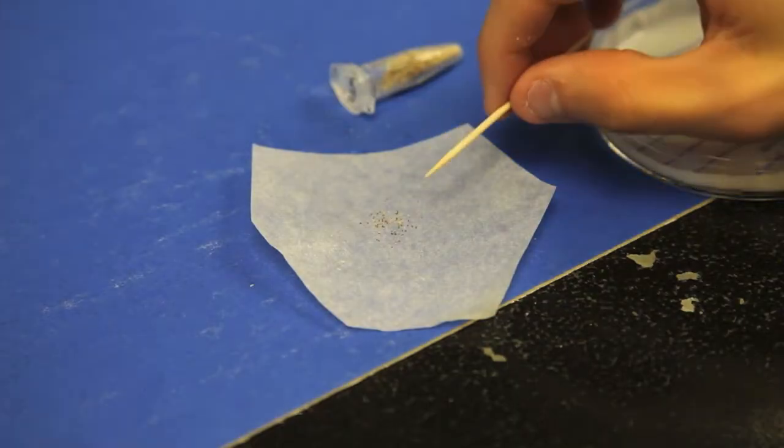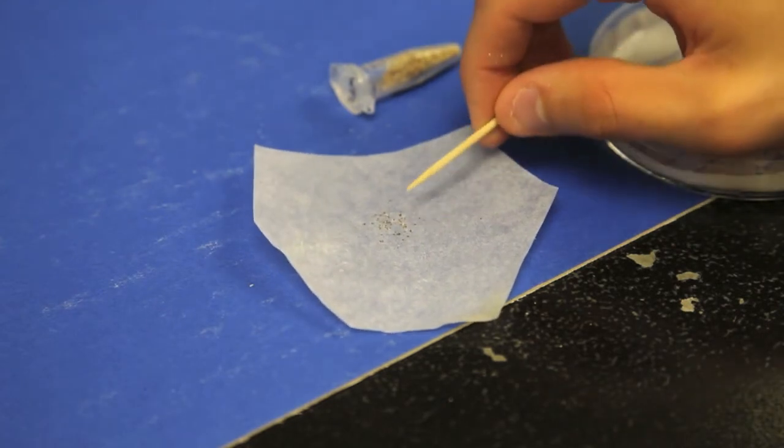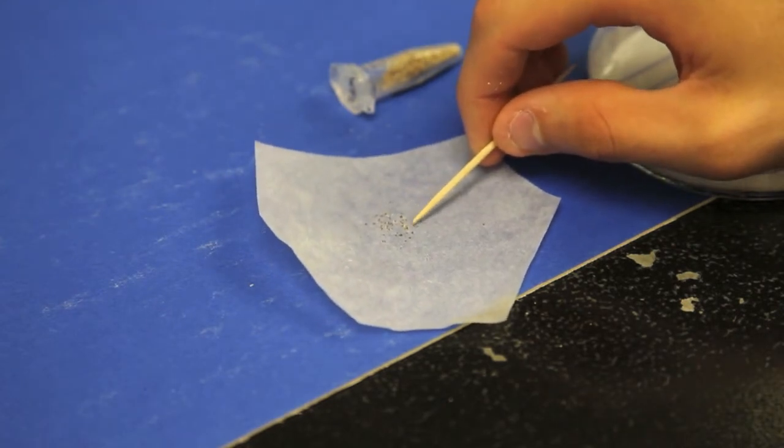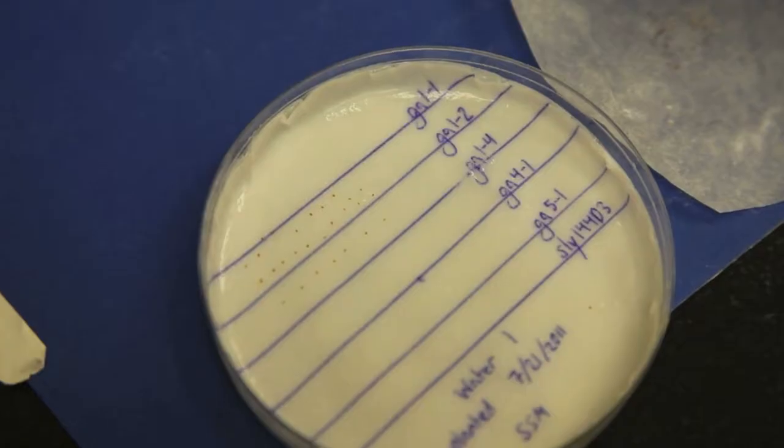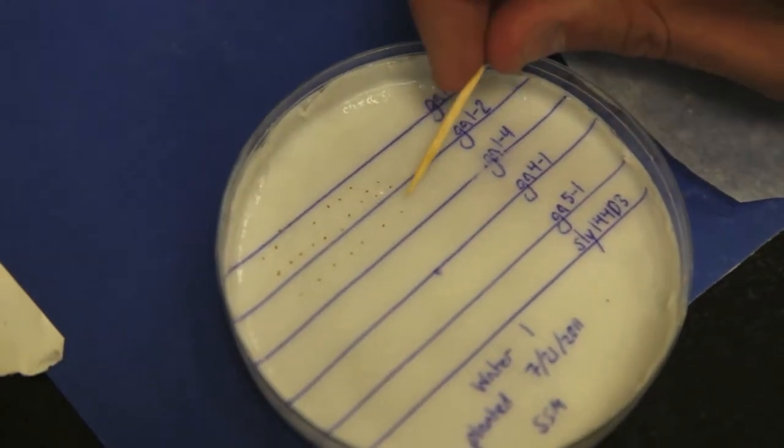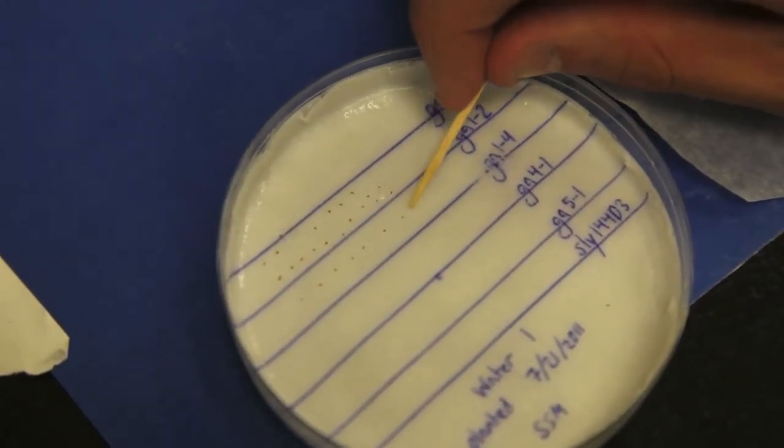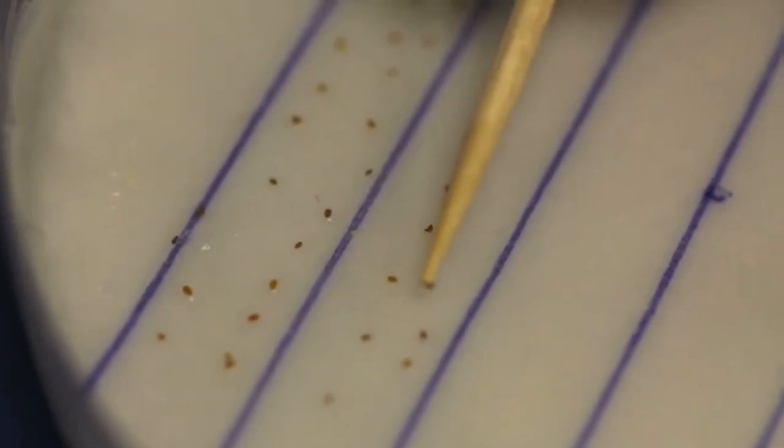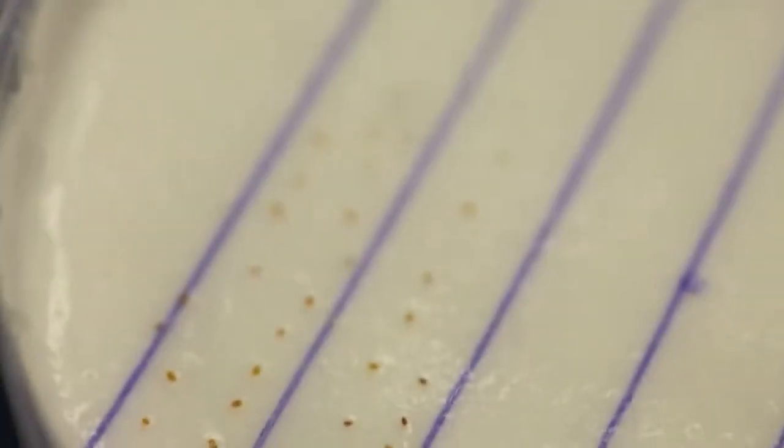With its tip wet, you can use the toothpick to move individual seeds from the wax paper to your petri dishes. Simply touch the tip to an individual seed and then place it in the correct spot over your petri dish. Be careful to place the seeds within each section so that you can later identify them.